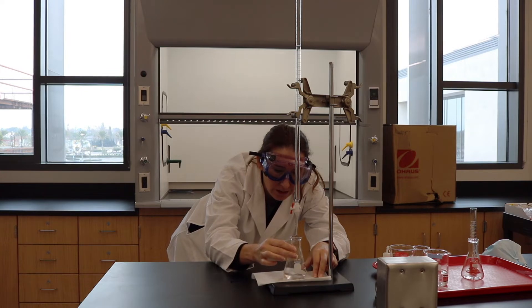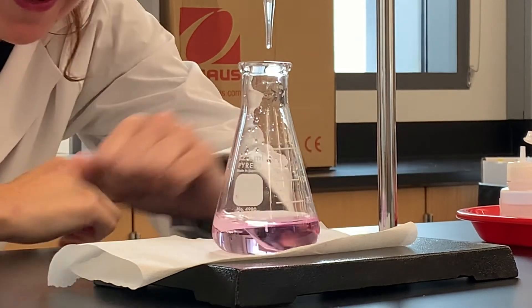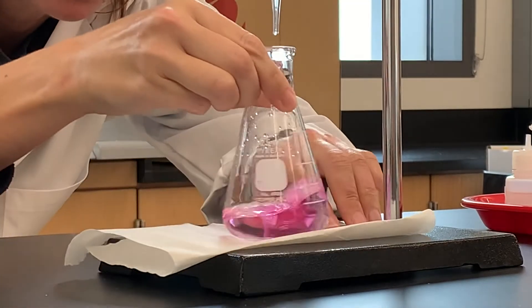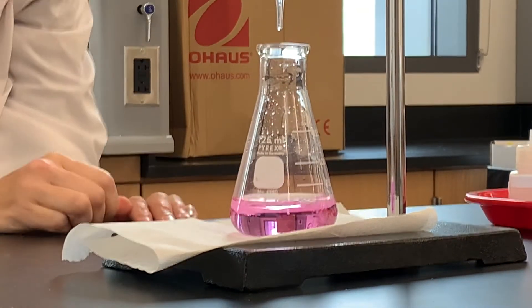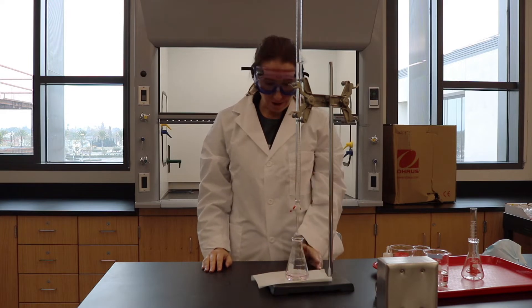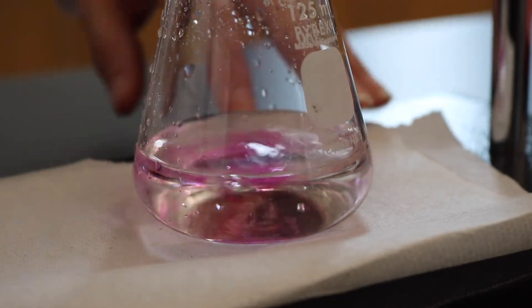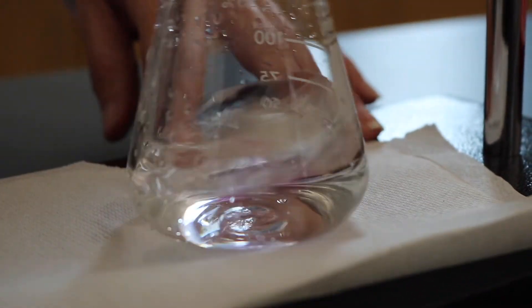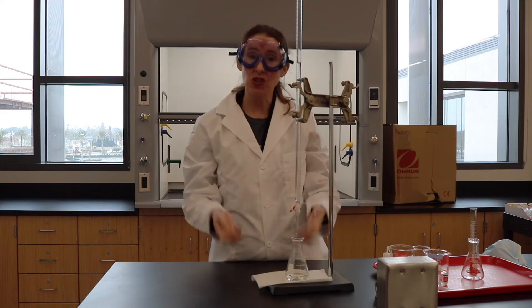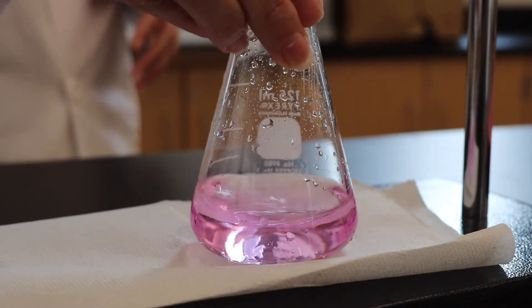One drop will make it go from baby pink to fuchsia, and fuchsia means you've gone too far — we want to go just to our end point. Getting very close now — and there we are. Now it's pink and it's stayed for about 20 seconds. There we go, at our end point. That means the amount of our acid equals the amount of our base. We can use the amount of base we added and the known amount of acid to figure out the molarity, or the concentration, of whichever one is the unknown.